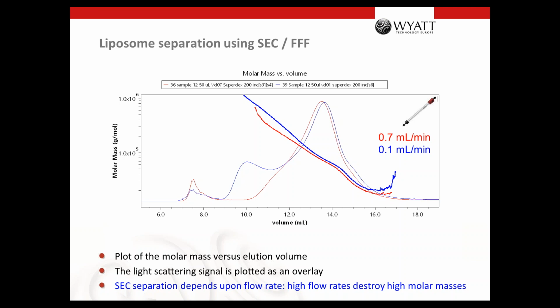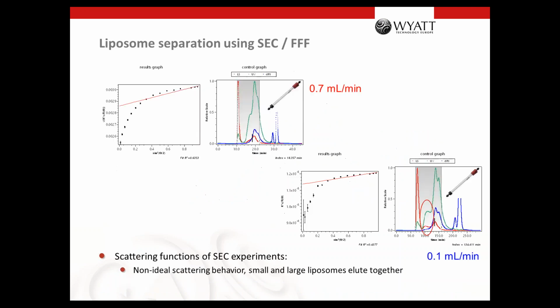Another problem is the separation, which you can see very nicely in light scattering. When you look here at 18 minutes, for example, at this slice of the light scattering plot, because that's 1 divided by Rayleigh ratio, you see that the lower angles, 2, 3, 4, have a huge light scattering signal. And you see the fit is very bad.